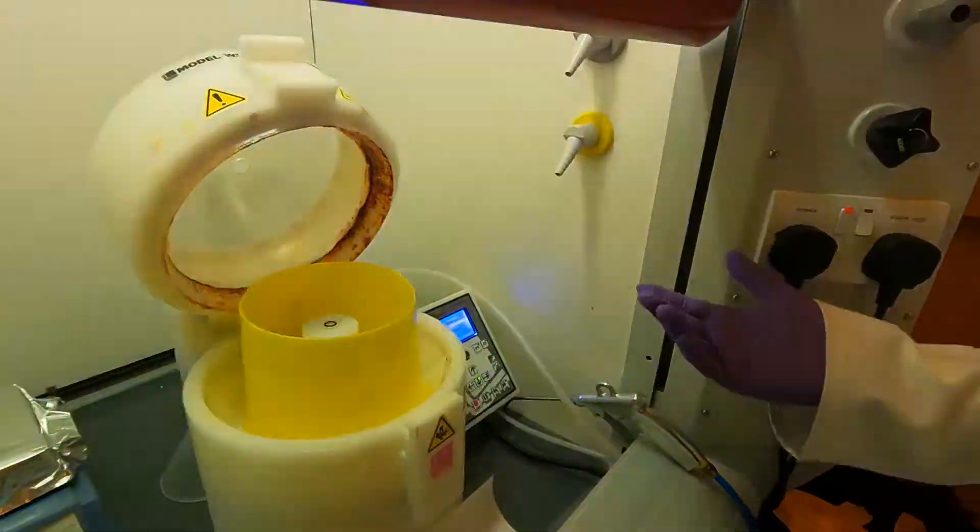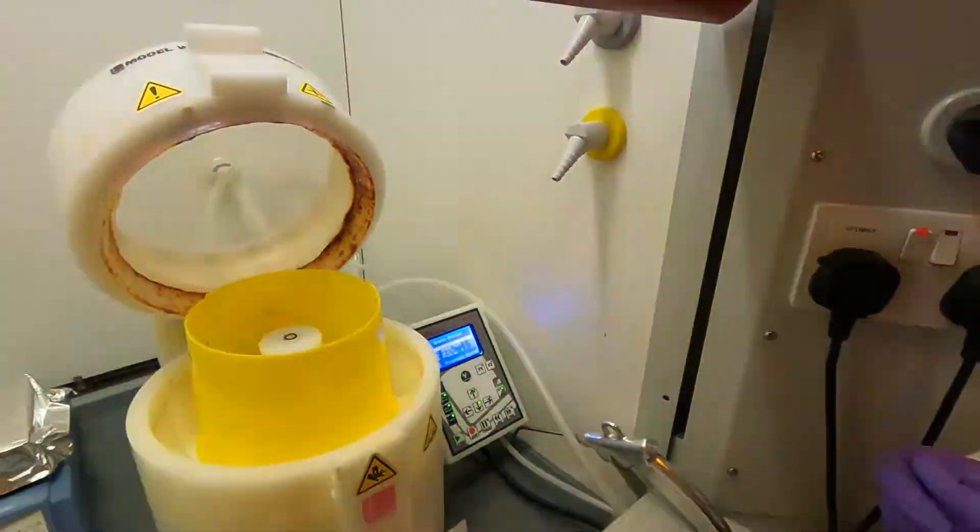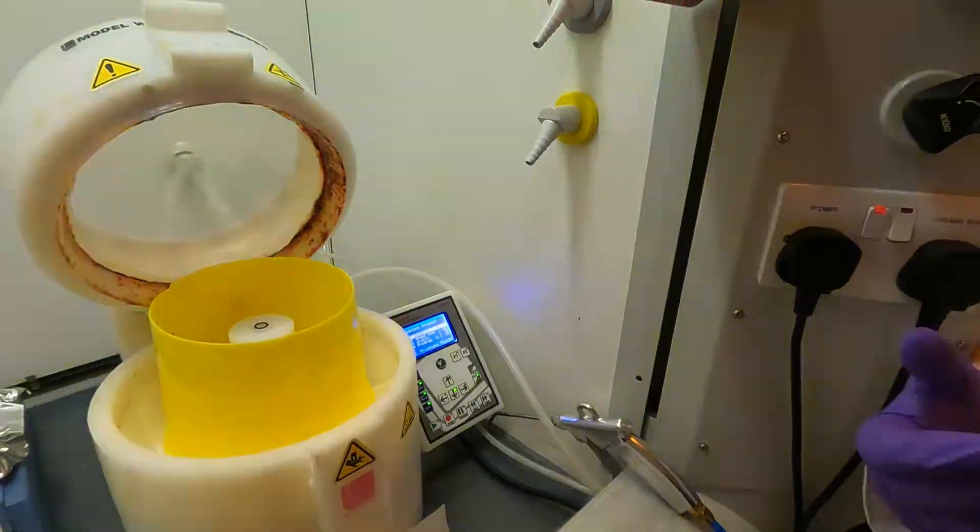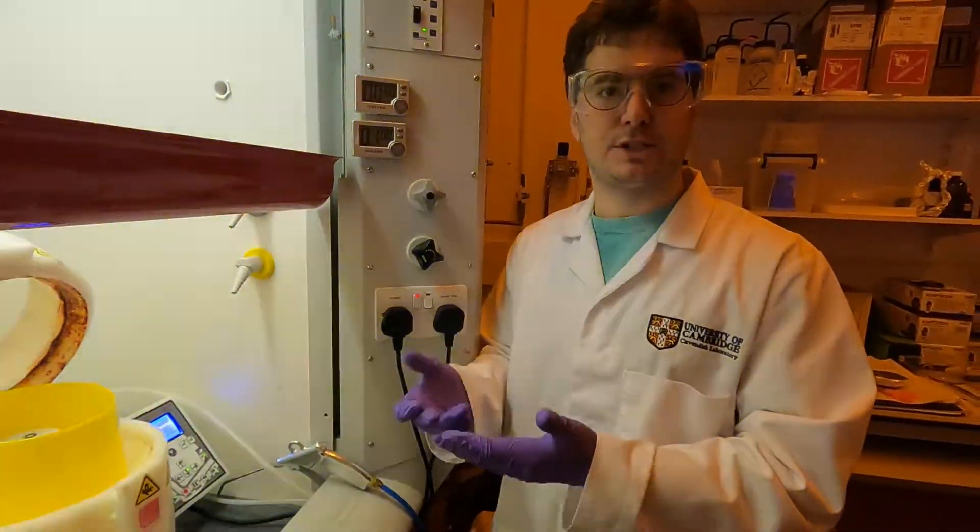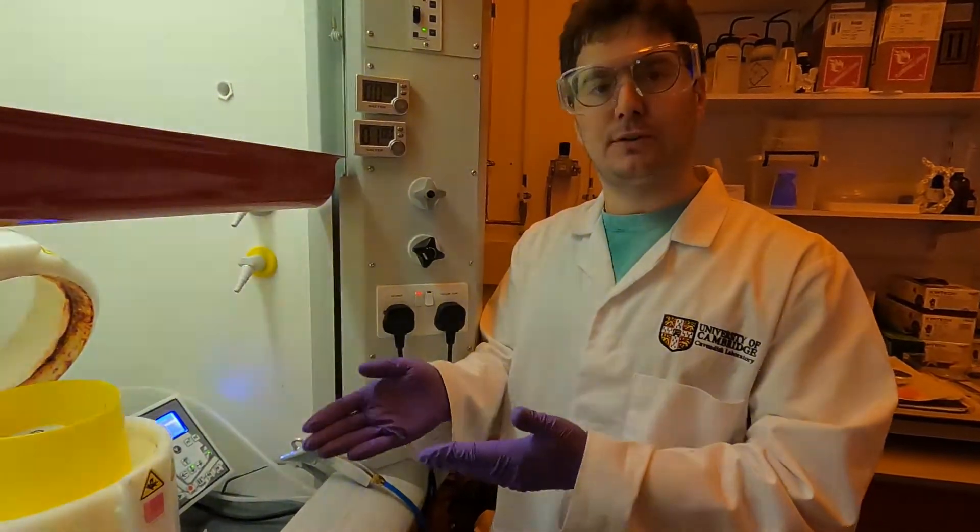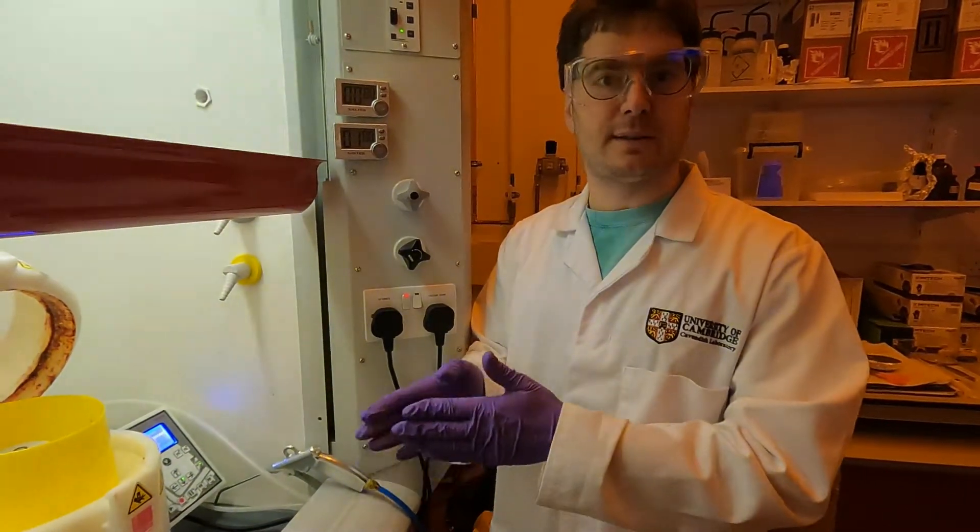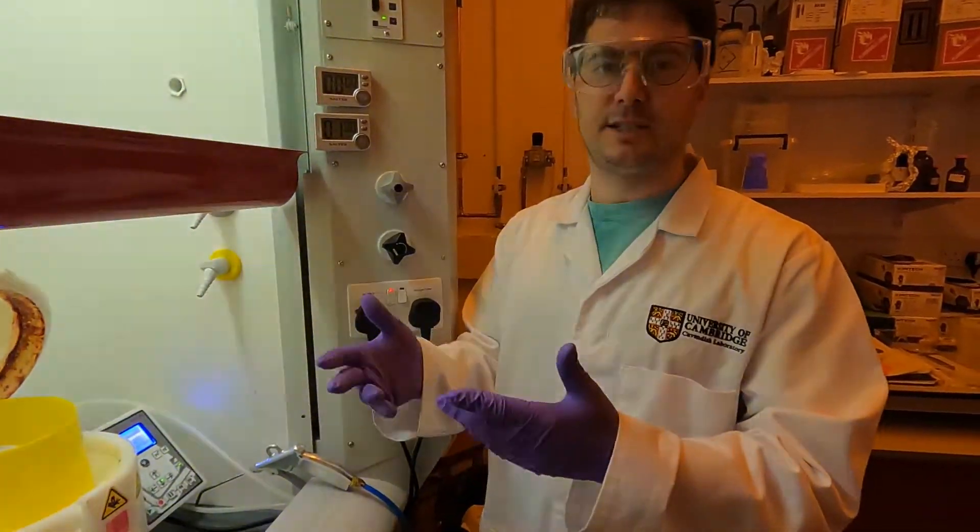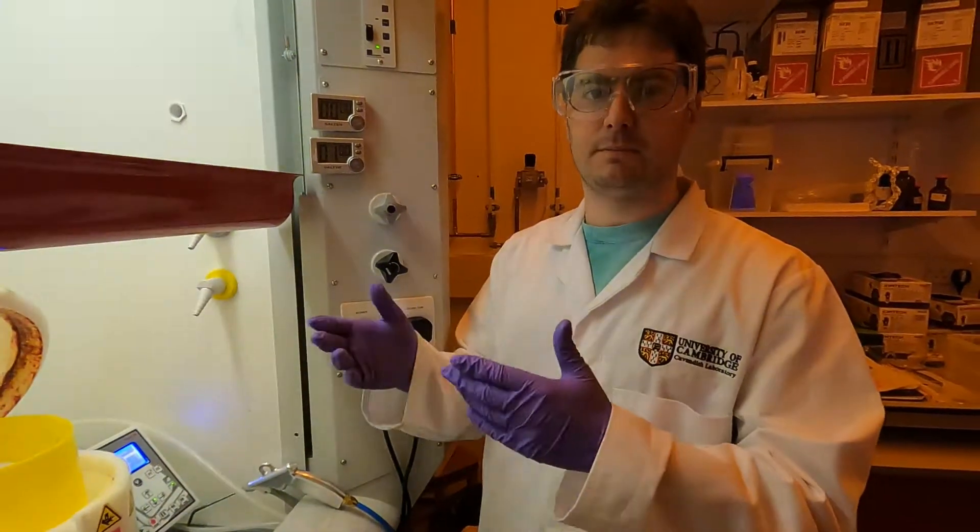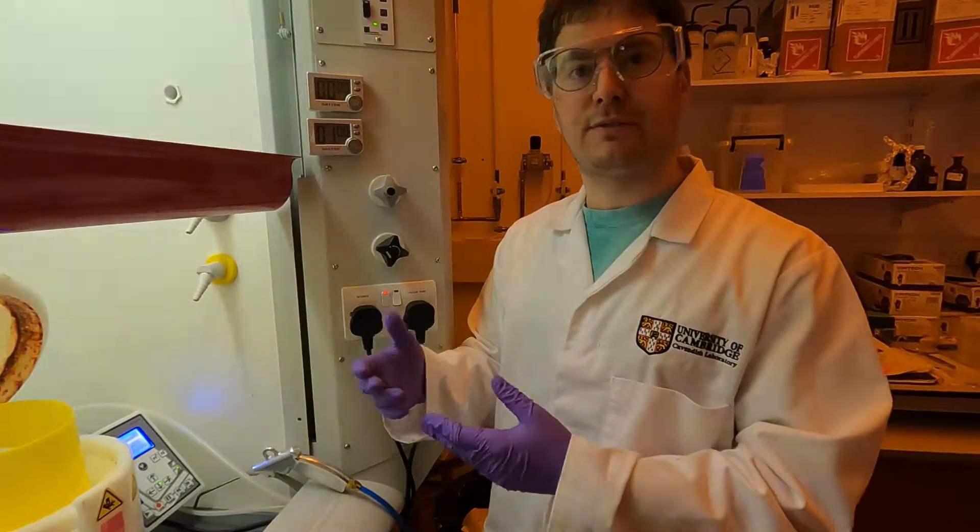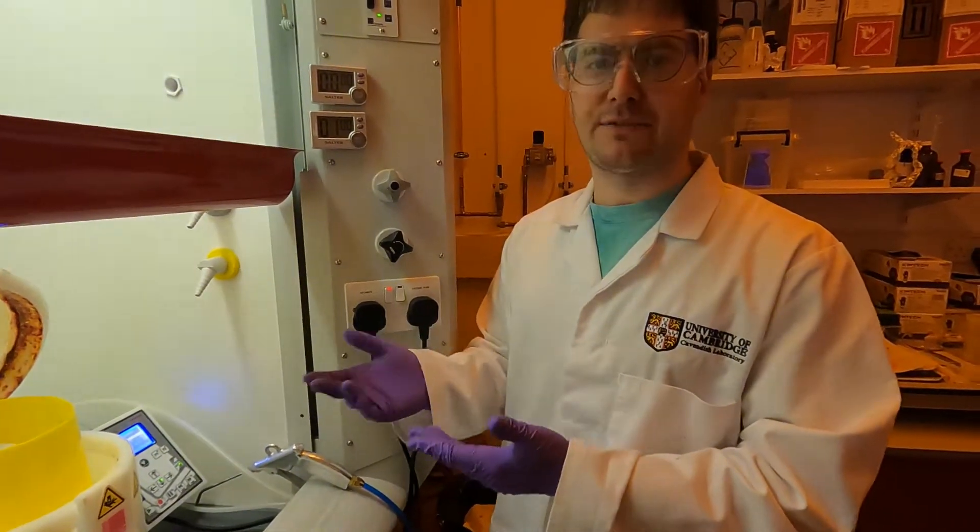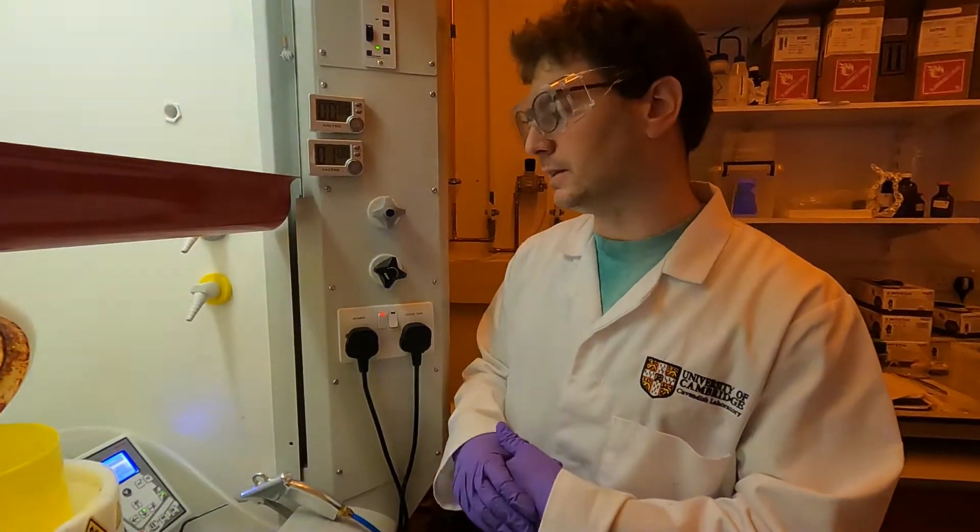The next step is to set the settings of the spin coater. The settings will depend on the type of process that you're running, so on the type of photoresist that you're using. For the experiment today we'll be using the SU8 2010, which nominally is designed for thicknesses between about seven and twenty micrometers, and we'll spin it at 1500 rpm which will give us a final thickness of about 15 micrometers.